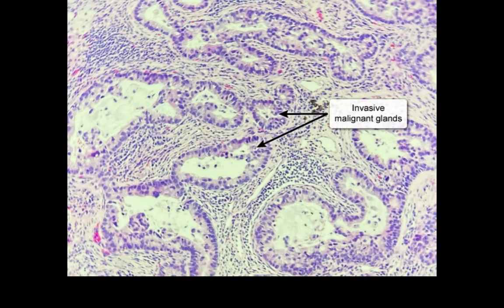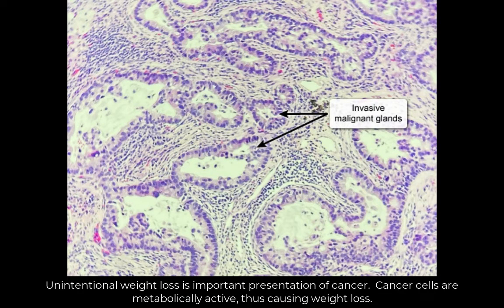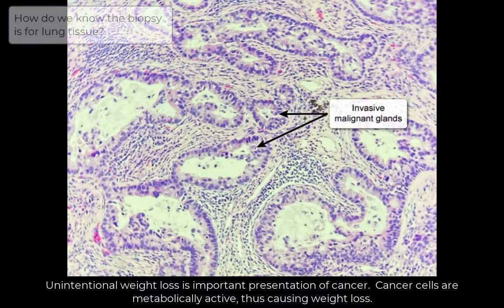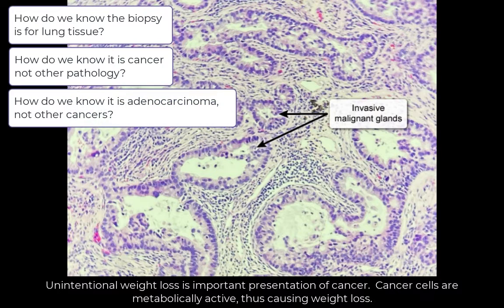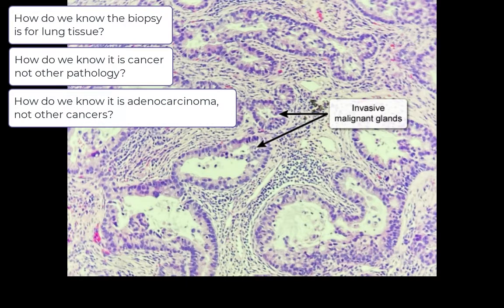This pathology slide is for adenocarcinoma, taken from a patient with weight loss and hemoptysis. In this discussion, we want to answer some questions: How do we know that the biopsy is for lung tissue? How do we know it is cancer, not inflammation or other types of pathology? How do we know it is adenocarcinoma, not other types of lung cancer? Also, we will see some additional features of this tumor.